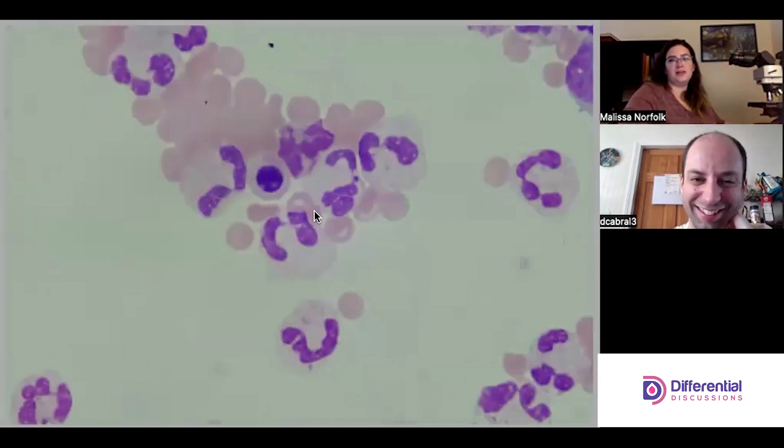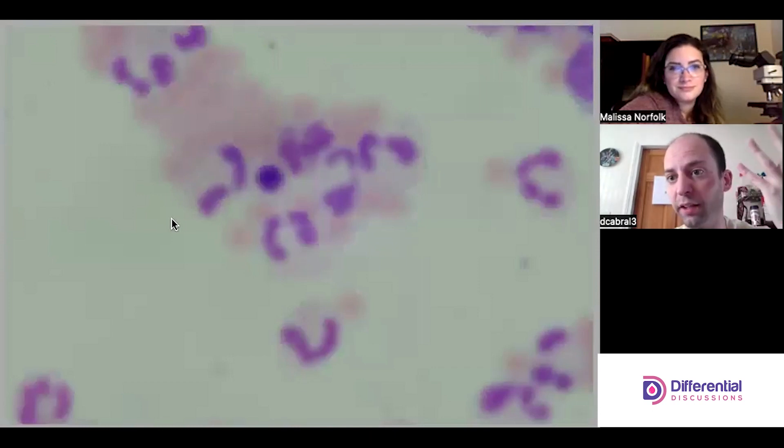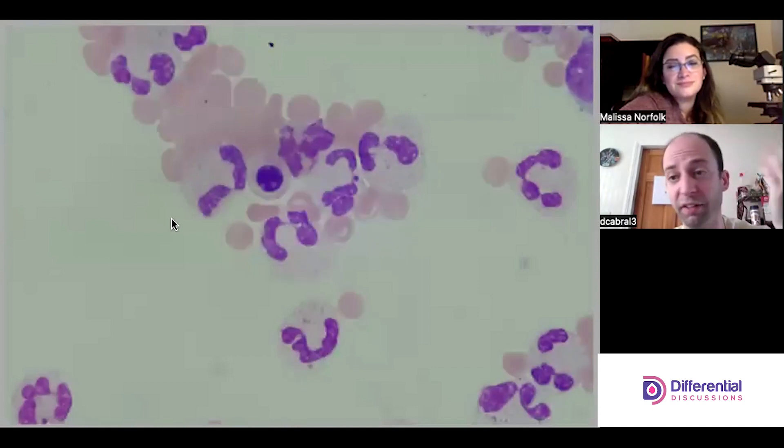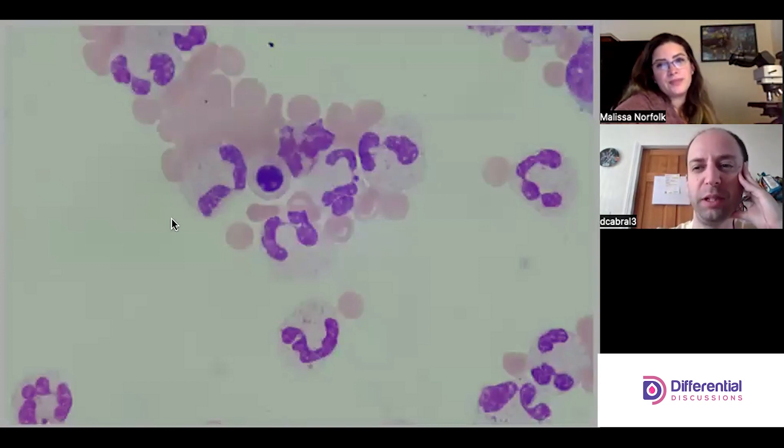I just want to stop here and say this is not a nucleated red blood cell. A lot of people would look at this and think NRBC — not a crazy thing for a student or even a tech at a glance — but what speaks to you that makes it not one?